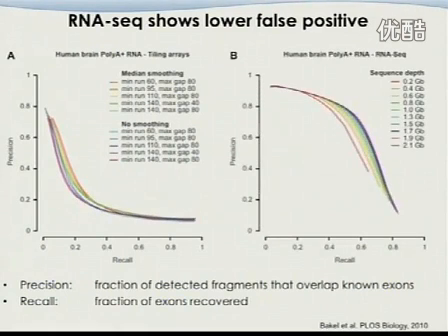For the RNA sequencing, the data becomes much, much better. You can see that there are multiple lines here, and each line represents a sequencing depth. This one is not as good, because we really want it to go to that corner. But for this line, they only used 200 million bases of information, which is equivalent to about 4 million mappable reads, which is not too many.